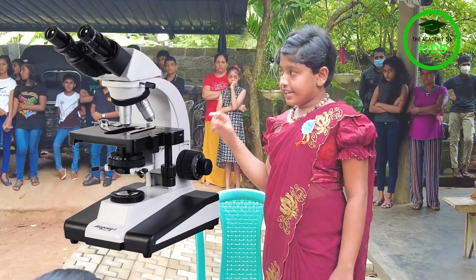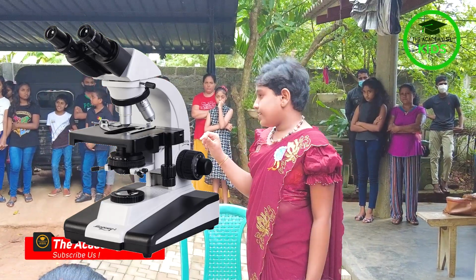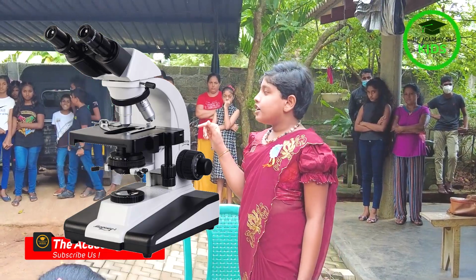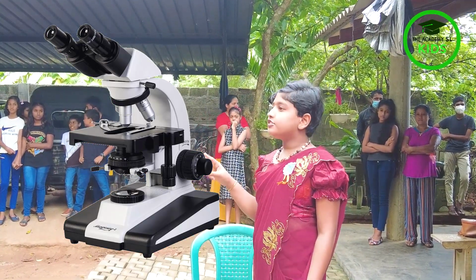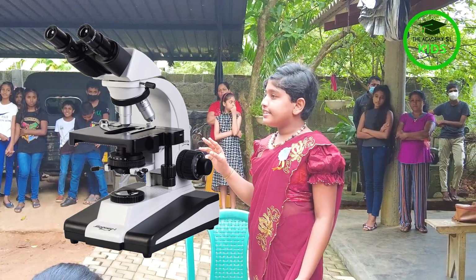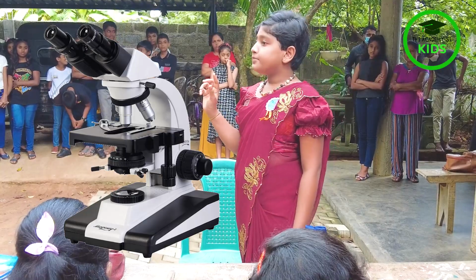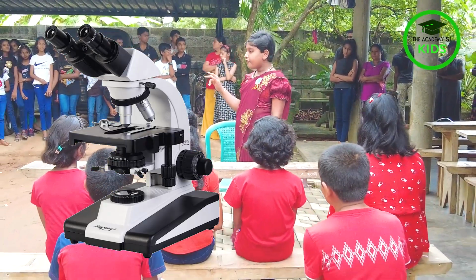Here we have stage clips. We use these stage clips to fix slides onto the stage. This is the base and this is the stage. Here we have three objective lenses. They are low power objective lens, mid power objective lens, and high power objective lens.